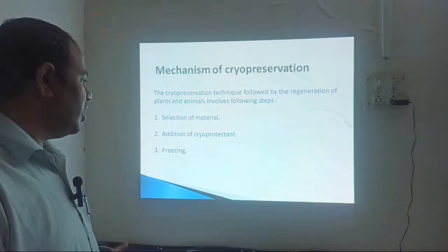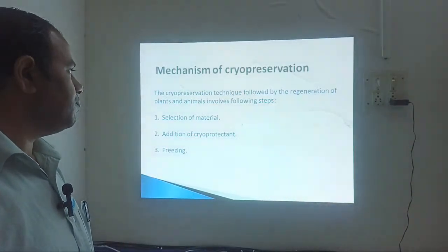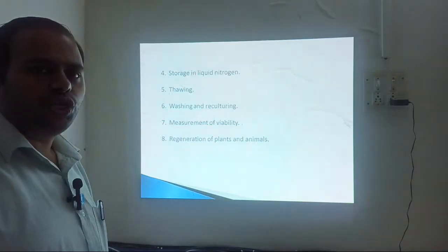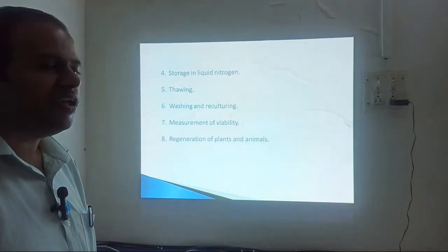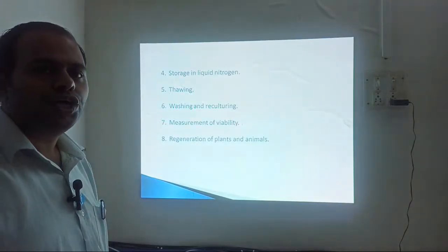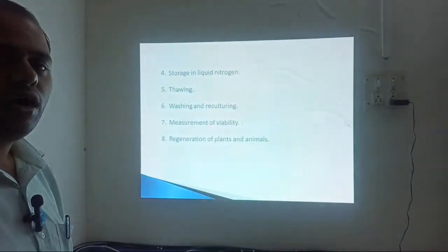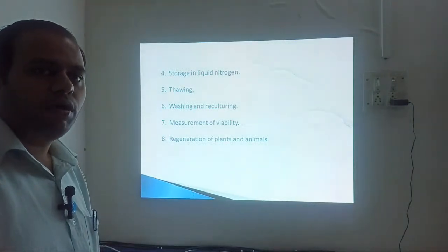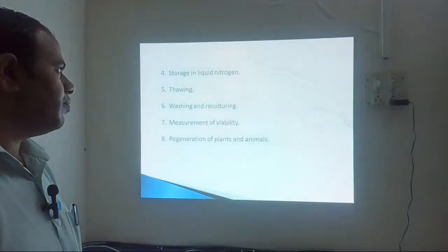And then the next step is freezing or reducing the temperature. After that, storage in liquid nitrogen. You cannot directly plunge the tissue in liquid nitrogen. First of all, you have to freeze it, and then gradually you have to shift the storage to the liquid nitrogen, as it will ensure slow freezing of that particular material, and it will not harm that particular material.